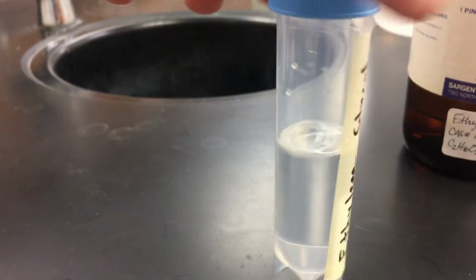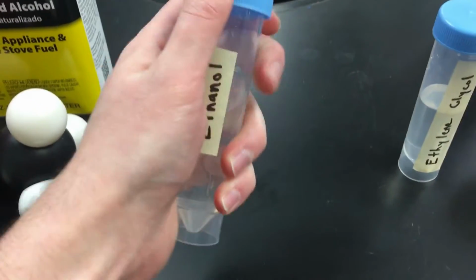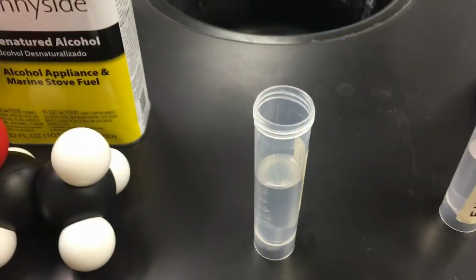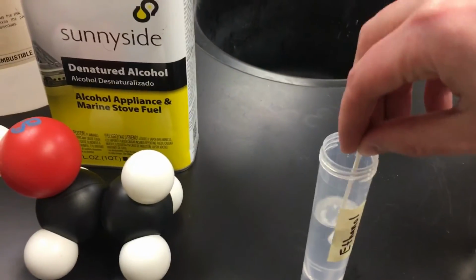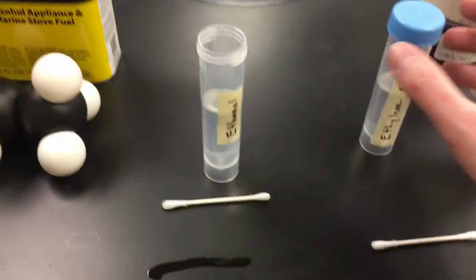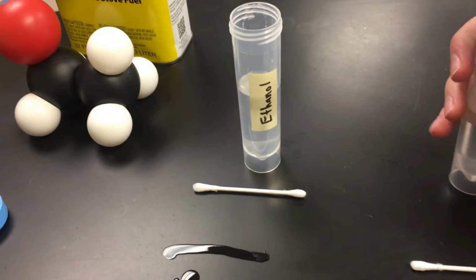Okay, now let's see if it also holds up for the evaporation rate. So let me take the cap off of this one. Let's see if I can do this one-handed. There we go. Right. I'll draw a line. The ethanol doesn't go away immediately, so it's better than acetone at least. Let's see our ethylene glycol.